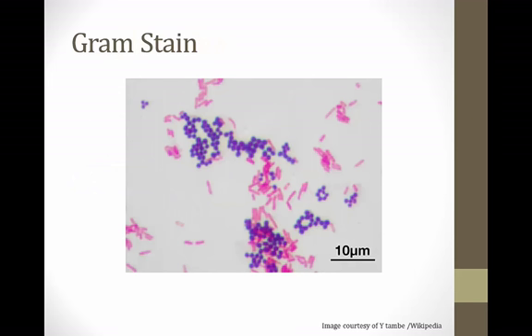The most important stain from a medical point of view is the Gram stain. It identifies bacteria as either so-called gram-positive or gram-negative. If you look at this picture on the screen, you'll see some bacteria, like the ones I'm drawing a line around now, which form purple circles, and those are gram-positive bugs. You can remember that gram-positive has a P for positive, and P is for purple. They become purple on the slide. Some of the bacteria on this slide are also red or pink, like these ones I'm circling over here, and those are gram-negative bacteria. We're going to talk about this in a minute, but the bacteria stain differently with the Gram stain based on characteristics of their cell wall.